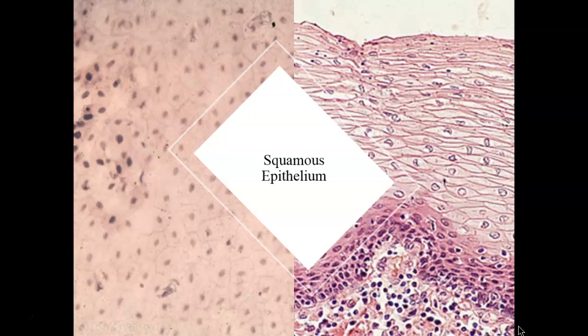Now we're also going to learn that the epidermis is made up of different layers. Each one has a different characteristic that we'll identify. But just from this first look, down here, these closest to the basement membrane look very different from these cells, which look very different from these cells. So these on the outer edge up here, all of these are dead cells.